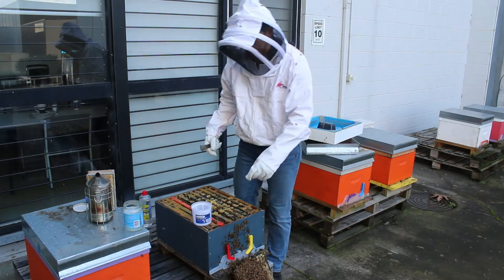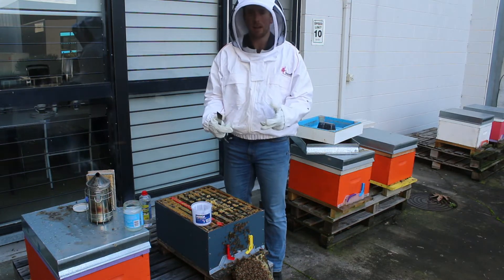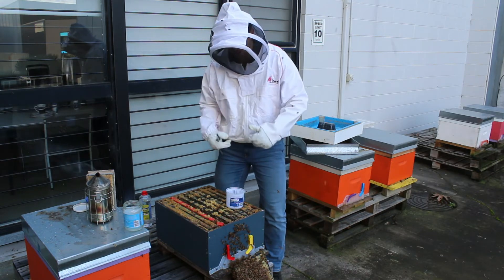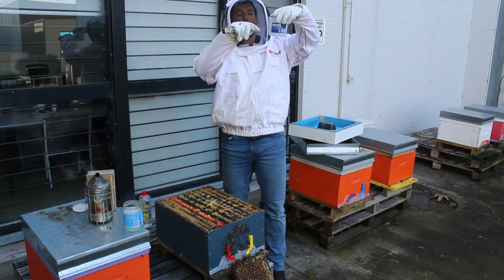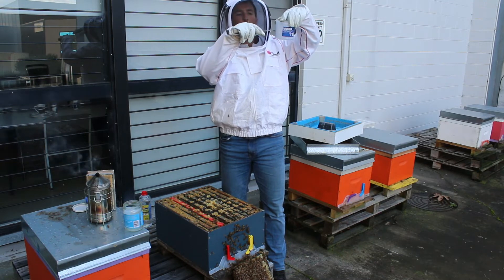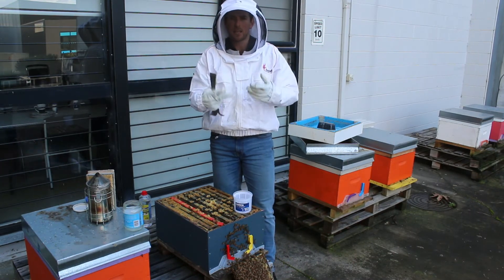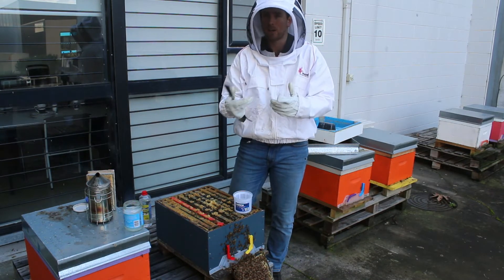Now what we want to do is simply lift up the frames, make sure the queen isn't on any of the frames, and then place the bottle there and just gently shake the bees in until you get about enough bees up to the marker on the bottle, which is the second tier on the little grate. That's about 300 bees — that's the number we want to go for — about 300, and then we can work out our varroa count calculations from there.